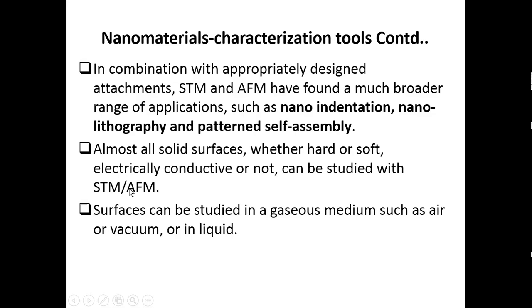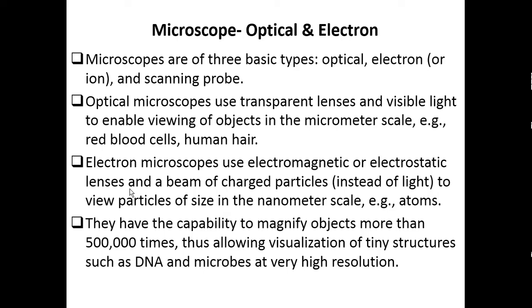Okay. So now we will discuss one by one about the characterization tools. First, we will discuss the conventional microscope. What is the conventional microscope? Our conventional microscope is the optical microscope, isn't it?